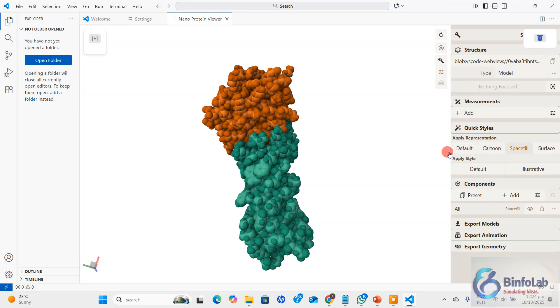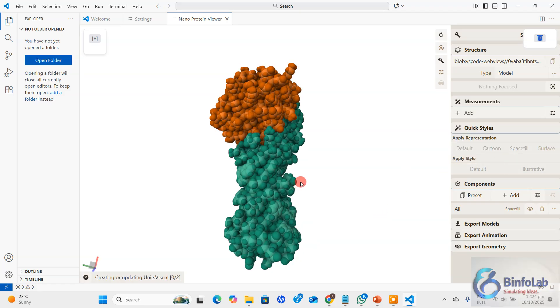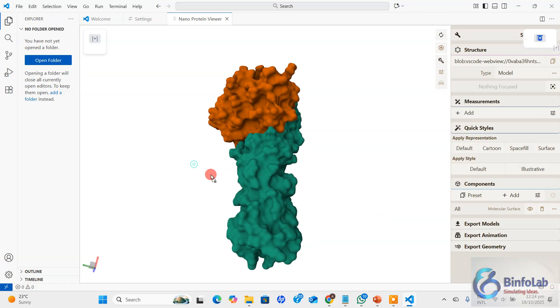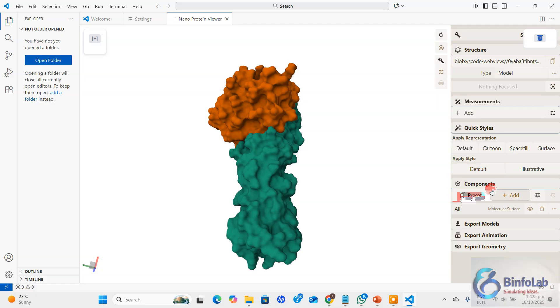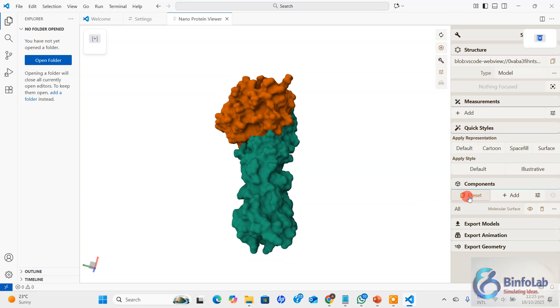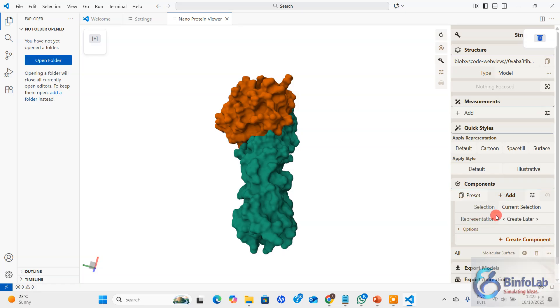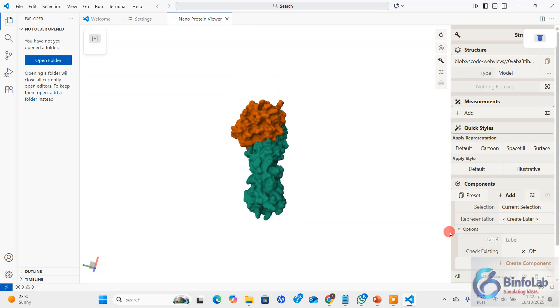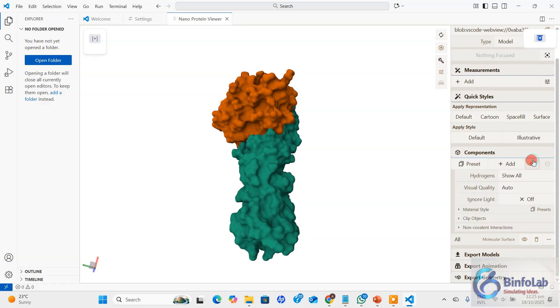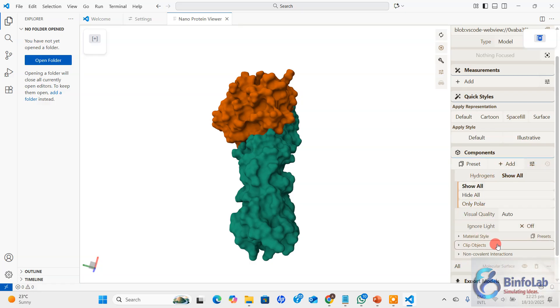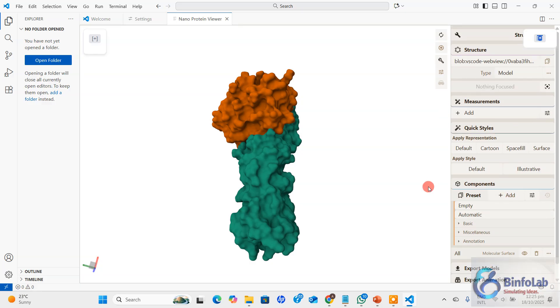This is one of the important parts. You can see this one is default, this one is cartoon, and this one is space field. This one is the surface. This is illustrative, this is default. If you are interested in some quick style representation it's here. But if you want to do some more things, click here add and perform some selection. You can hide the hydrogens and many things.